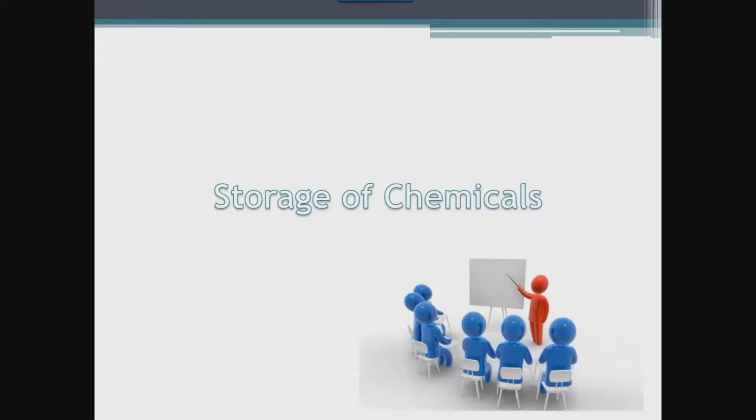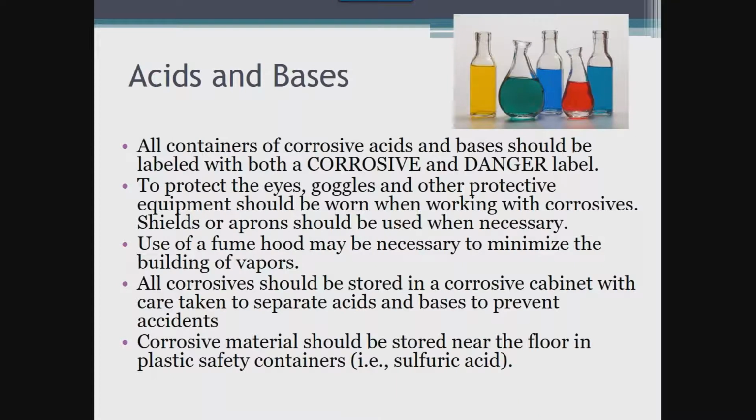The proper storage of chemicals is imperative to a good chemical hygiene plan and to staff safety. This is to ensure that your laboratory does not have a chemical event due to either the reactivity of chemicals or an unavoidable accident. Acids and bases have very specific storage requirements. Storage of these reagents must be below eye level so that staff are not reaching up into a cabinet or on a shelf and inadvertently tip the container onto themselves.